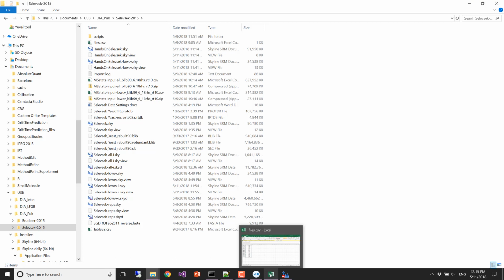Andy Hufnagel is the first person that I believe to have created a clinical mass spec assay. I think there are more since then, but he created a thyroglobulin assay for measuring thyroid cancer remission, and it measures one transition and one peptide to measure one protein. But it's a very tuned assay. And why didn't they just measure 5? Well, because 5 wasn't as good as 1, right?